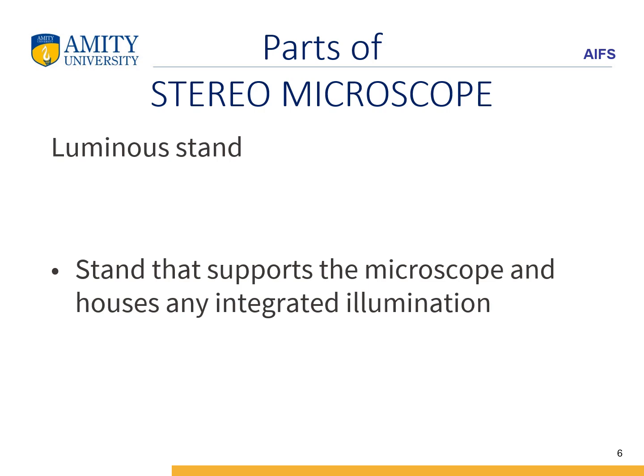Next would be the stand, the luminous stand. The stereo microscope has another part, that is the luminous stand, that supports the microscope and houses any integrated illumination. If there is any integrated illumination, it means transmitted or oblique light or reflected light can be there.